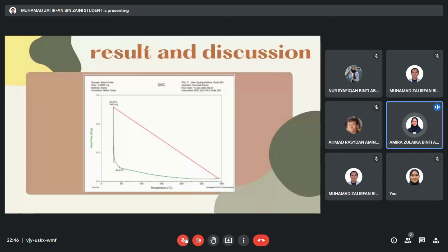Okay, this is the result obtained for DSC. Changes in phase transition are tracked using the calorimetry approach. Many of these thermal analysis studies do not examine the effect of sample preparation on the result, and the ease of sample preparation using a range of processes is considered a benefit of the methodology.